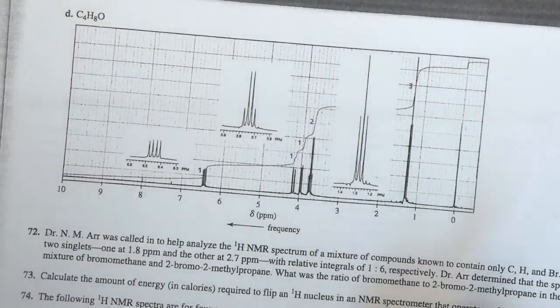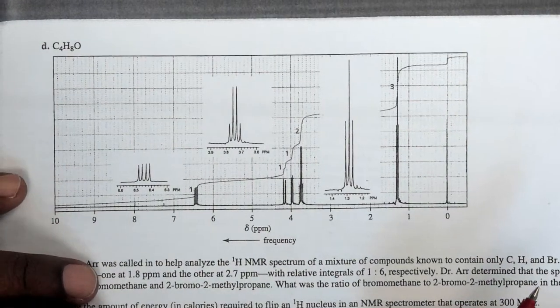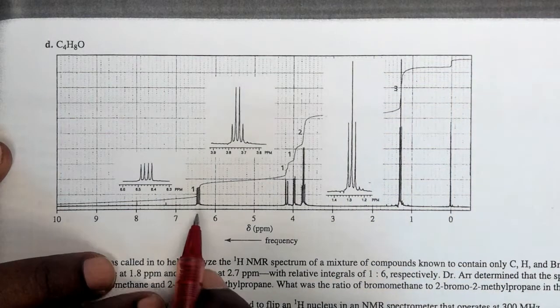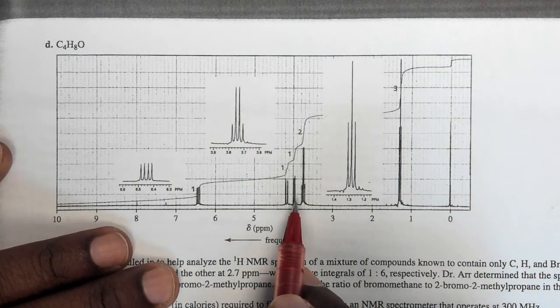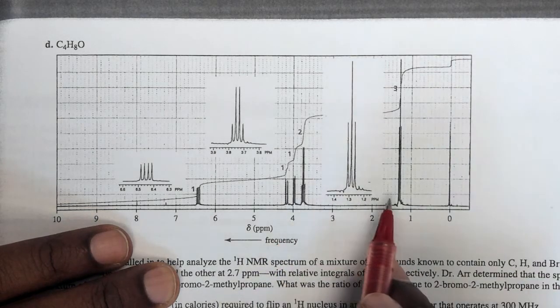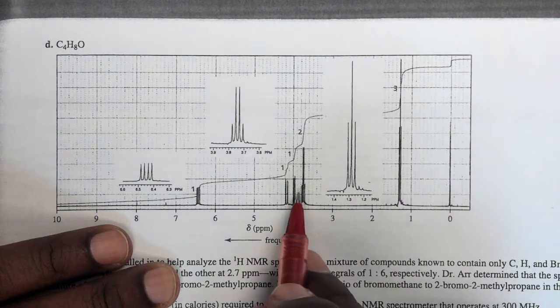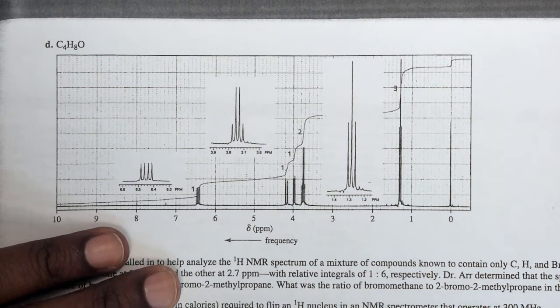Now we're trying to solve something where we have a similar spectrum, because we have a double doublet here, a doublet here, and a doublet here, and we have 2 other groups, or 2 other fragments, that I can actually make another fragment from, these 2 particular groupings or resonances.